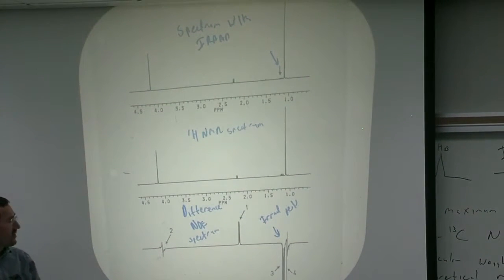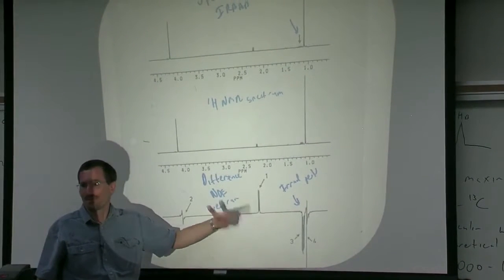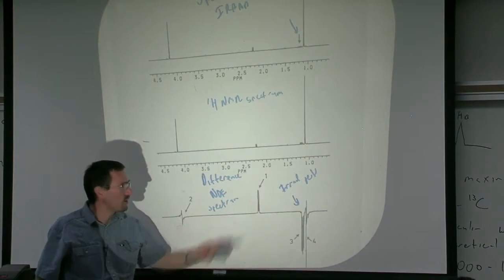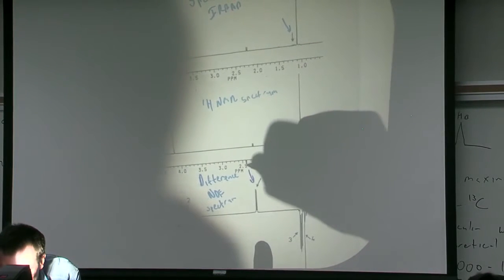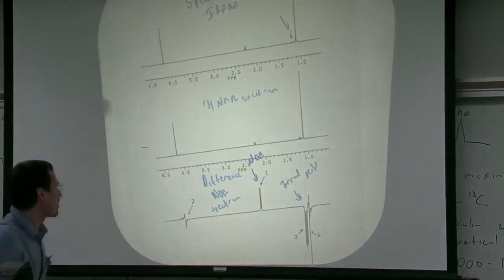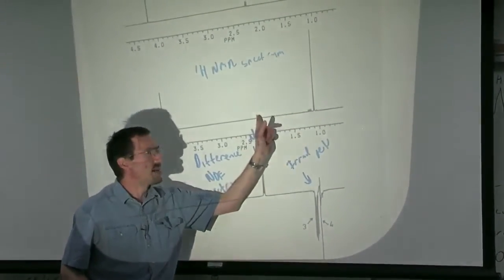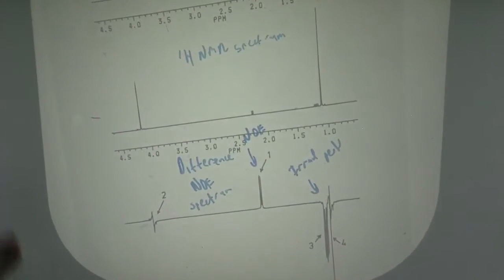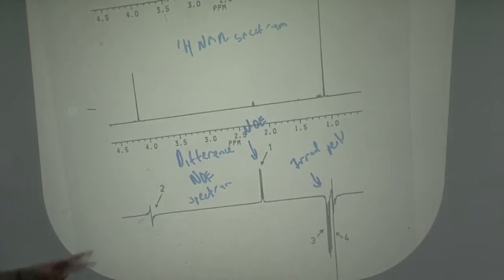But I want to show you the features. Okay, the thing that's glaring you in the face in this literally textbook example is that we see a nice NOE. We see a nice NOE over to the peak here. So there's some spatial proximity between this proton and this proton in the molecule. I want to show you some of the other features in the spectrum.